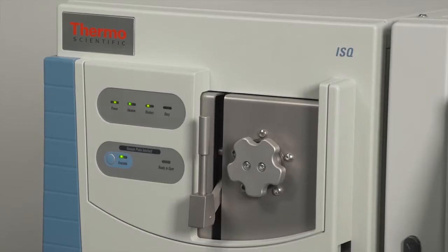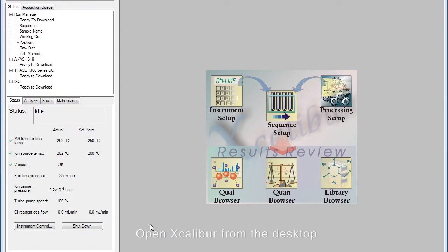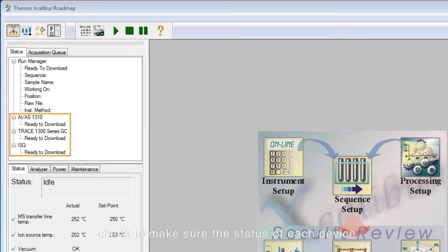Open Excalibur from the desktop. Check to make sure the status of each device is 'Ready to Download.'